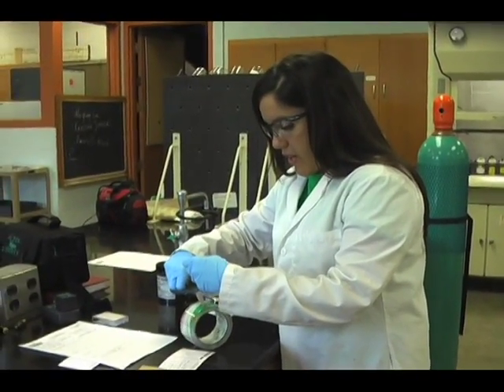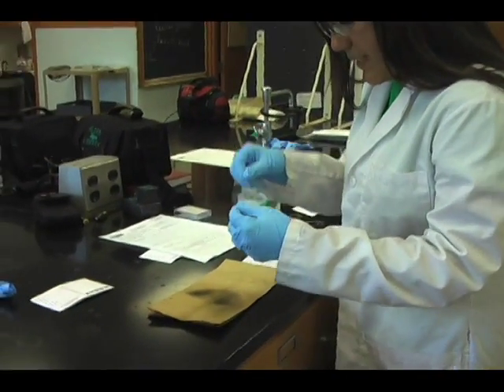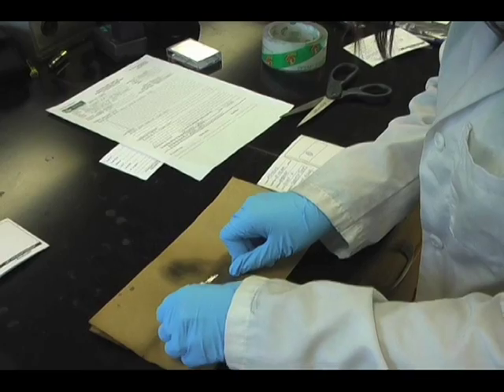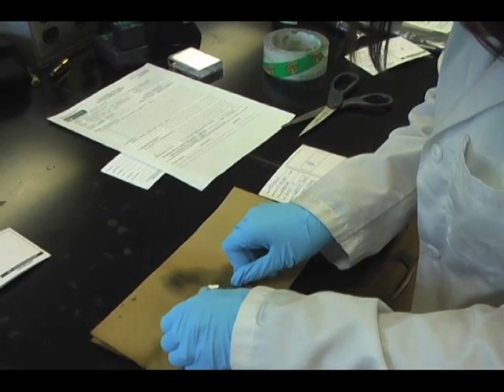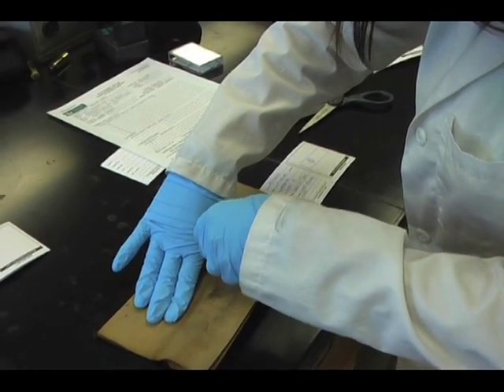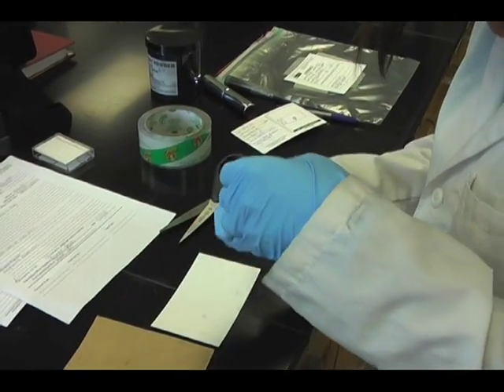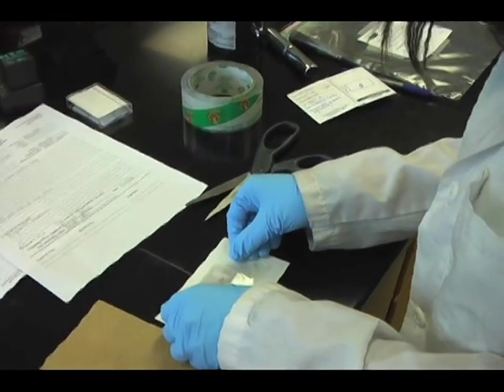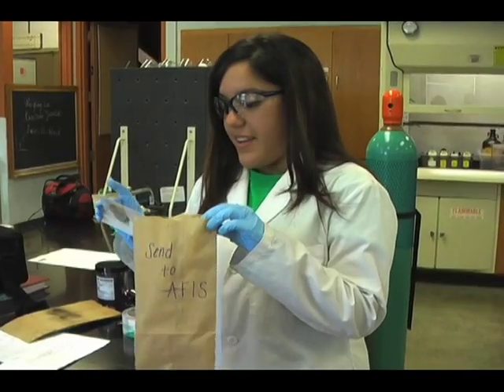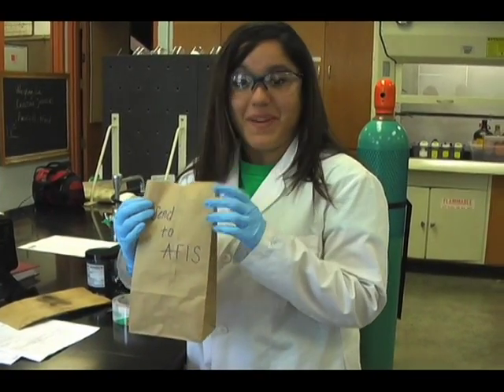Now I'm lifting the four fingerprints off the front of the baggie and placing them onto a fingerprint lift card. I'm making sure that there are visible dermal ridge patterns right now. They're being placed on the back of the fingerprint lift card. Now I'm placing the fingerprint lift cards into an envelope and I'm sending it to AFIS.